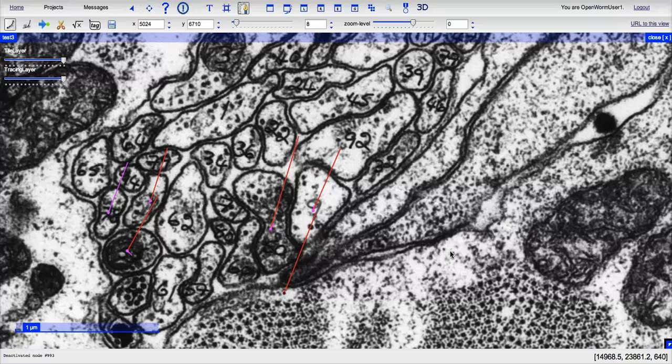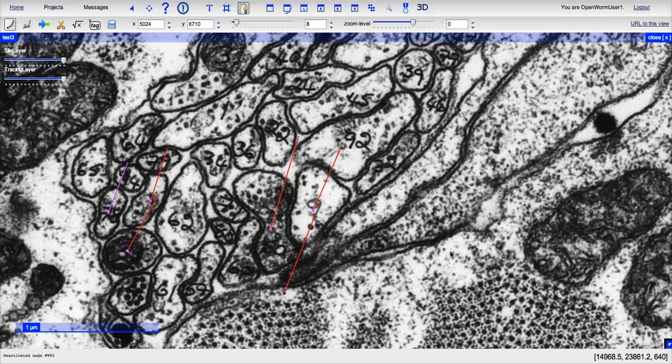Hi everyone, this is the second video in a series of videos about how to annotate C. elegans neurons using CATMAID.